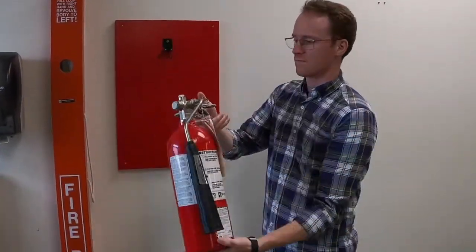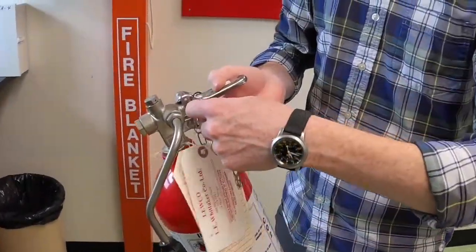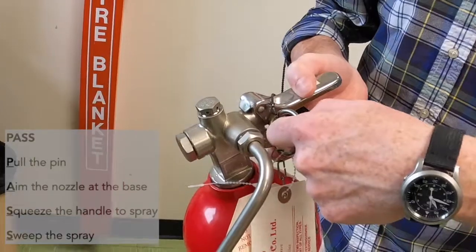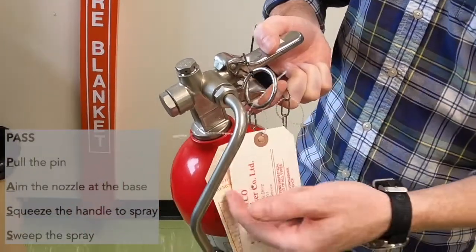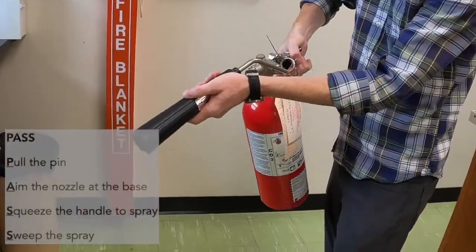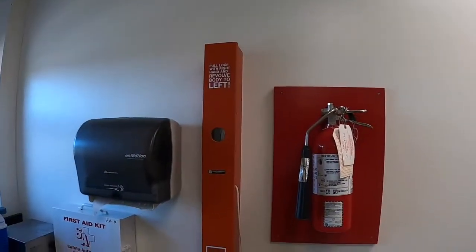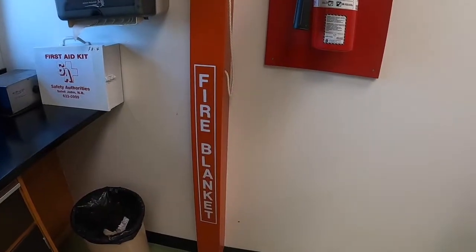To use a fire extinguisher is pretty straightforward. You take it down from the wall and follow the PASS acronym: pull the pin, aim the nozzle at the base of the fire, squeeze the handle, and sweep across the base of the fire. There's also a second fire blanket at this location.